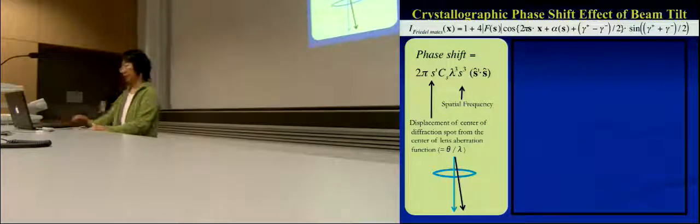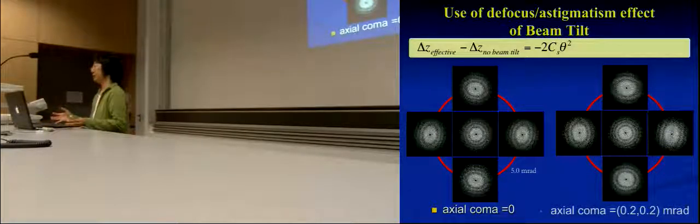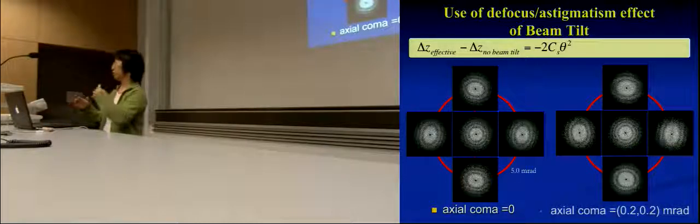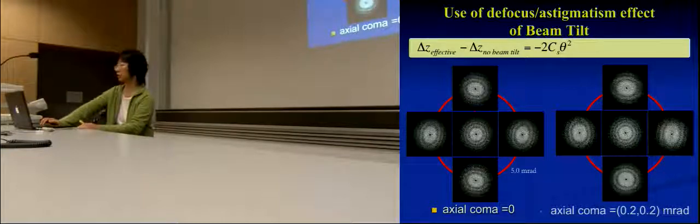The second one is a little more problematic for us. In this case, let's say I didn't know I have beam tilt. Then I do my processing. Maybe I see some astigmatism. I do our normal CTF correction to it. That's fine. Now, even though we cannot tell where the source is, the effect is the same in terms of where I'm going to have phase shift, when I have the 180-degree phase shift or phase flip. So that's going to be the same whether it comes from objective astigmatism or it comes from beam tilt, because they all go into the same term in the CTF.